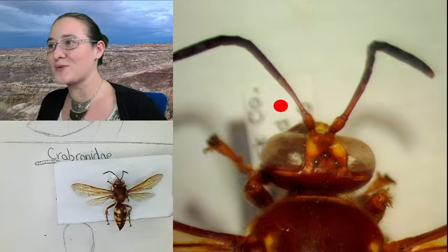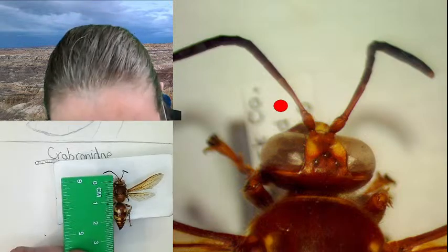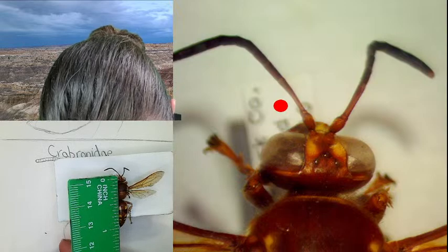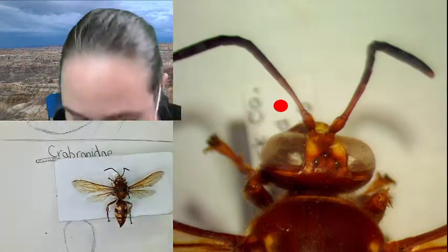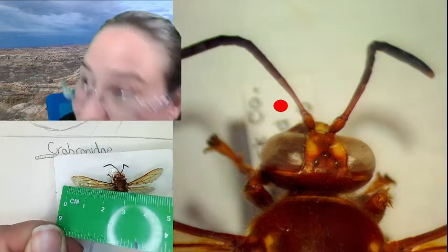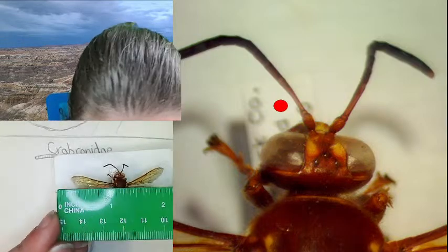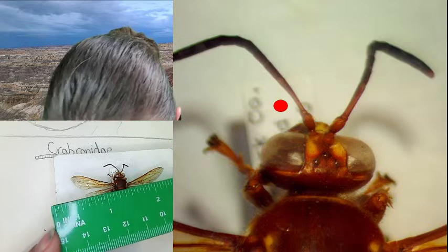The other thing that I forgot to give you guys was a scale, because I know that a lot of us ask for scales, and I forgot to do that this time. So, to give you a little bit of a scale, the length of the specimen from the front of the head to the end of the abdomen is about 3 centimeters, or about an inch and an eighth. Something like that. And then the wingspan from left to right in centimeters. And keep in mind, you can see how I'm doing this, so I'm eyeballing it a little bit, trying to make sure the specimen stays untouched. It's about 6 centimeters across for its wingspan, or about 2.5 inches.